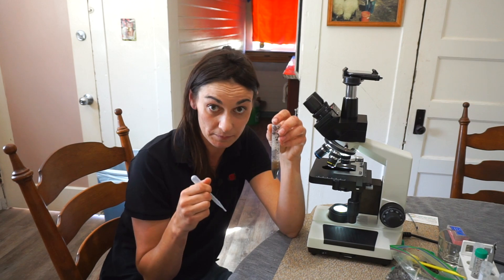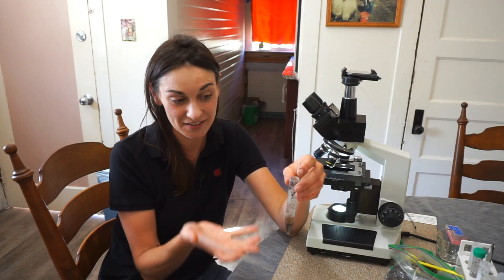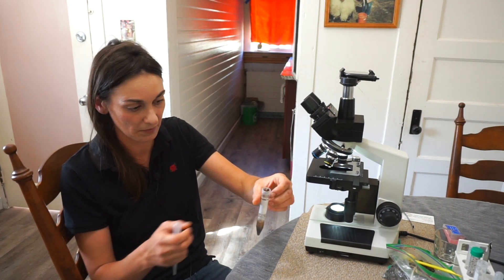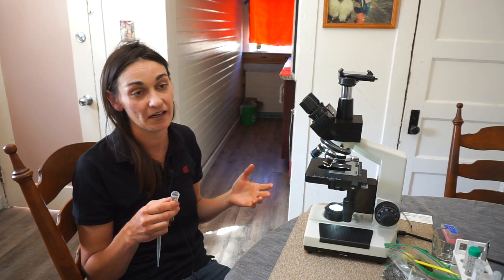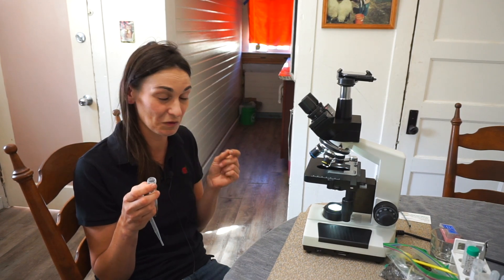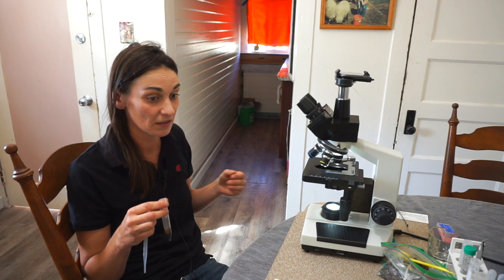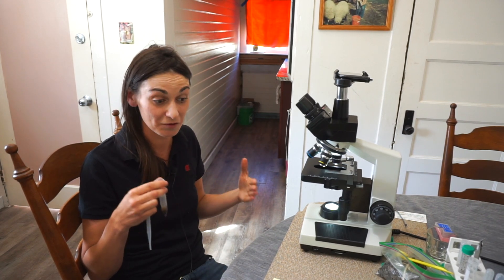Nematodes tend to sink towards the bottom — they're heavier, and there's no oxygen in here so there's nothing to keep them going until you shake it up again. Flagellates tend to float more to the top, depending on the quality of your sample. I've noticed in taking samples that I tend to find more nematodes when I pull from the bottom. So if you only look at one slide, you're not looking at it enough, because there's so much life in such a small amount of soil it will blow your mind. The chemistry of soil will change from one millimeter to the next, and so will the microbial community.